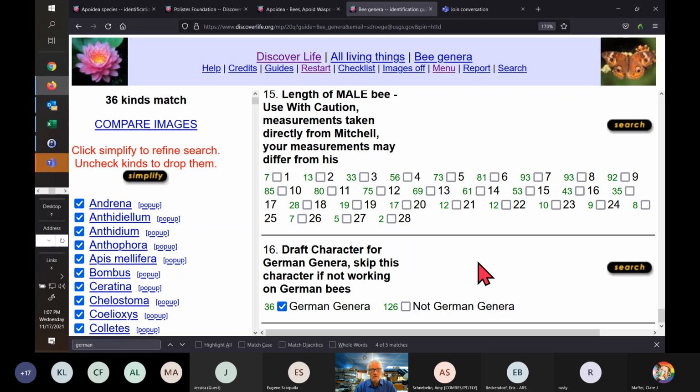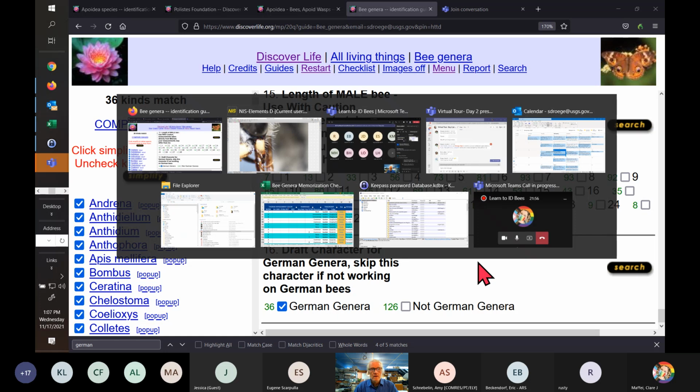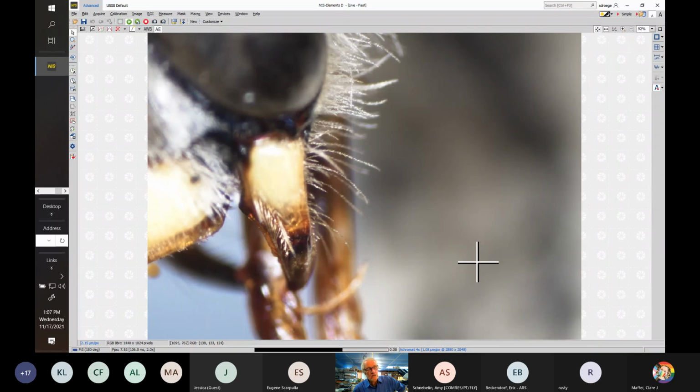Okay, now we will jump to the microscope and we will look at Xenoglossa. So we'll tackle Xenoglossa first. These are bees throughout North America. We have them in the east, although Xenoglossa are primarily southern. I'm not sure if they have been recorded, probably in New Jersey, but not much above Maryland. We only have a handful of records in some people's books, but not in the master list that we use, which is put together by Jenna Asher.